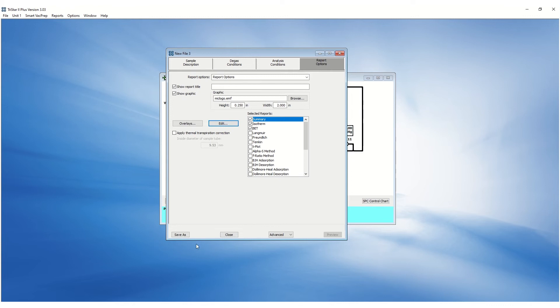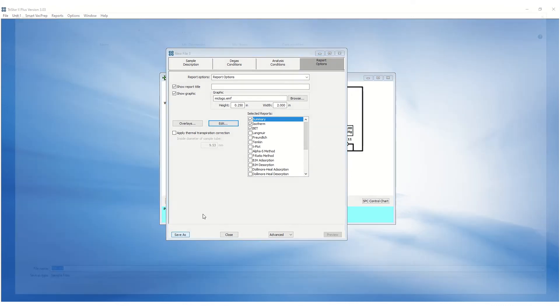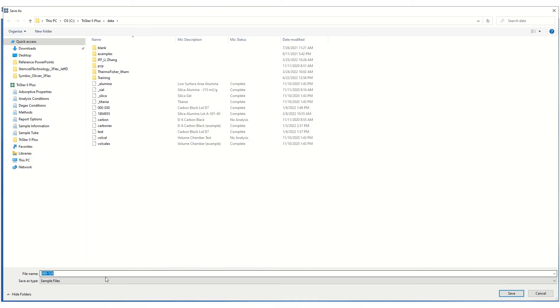After creating a sample file, click Save As, enter the desired name and save.